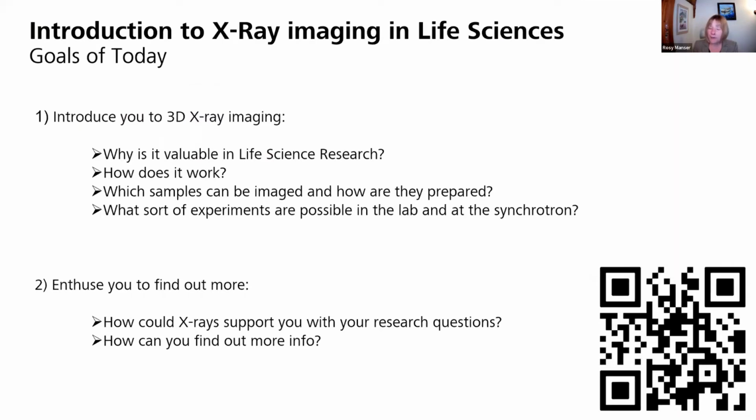So my background is actually light microscopy rather than X-ray imaging. I come from a kind of confocal, super resolution, light sheet background, and I discovered X-rays in 2015. And what occurred to me at the time was the potential power that these had for complementing other microscopy technologies within life science. So my part of the talk today will be to introduce X-ray imaging to you, why it's valuable to life science research.